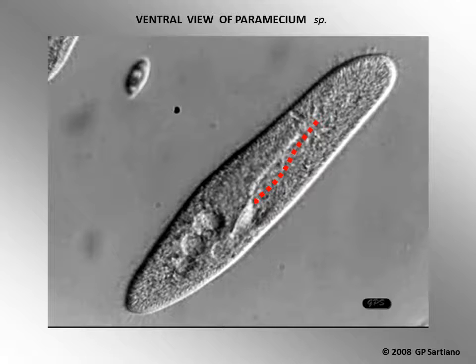However, there is a distinctive midline grouping of cilia which converges upon the cytostomal orifice.